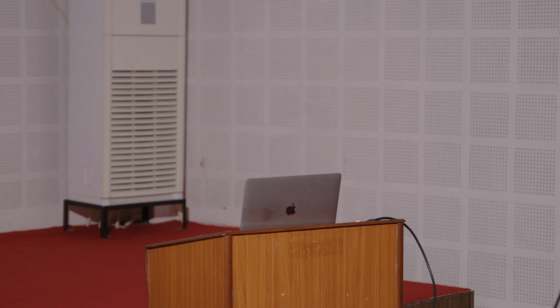Yeah, we looked at ways, but we then thought it was most honest to just say we made up the iron 3 solutions and measure the color, because we had no way to confirm that we always had 100% conversion of our iron 3 into iron 2. So we asked him, where is your calibration directly using an iron 2 solution? And he said, huh? I just took the iron and I followed the protocol. So that's when you get an engineer to do a chemistry project.